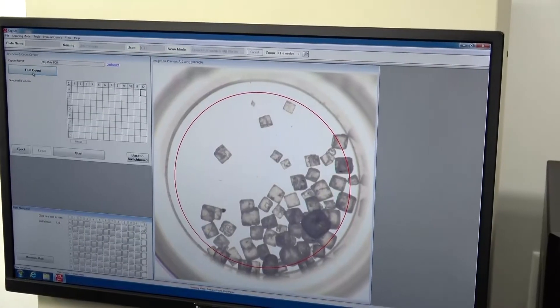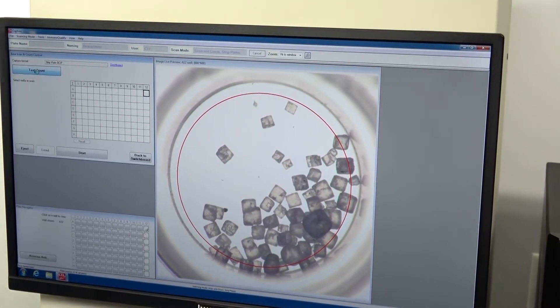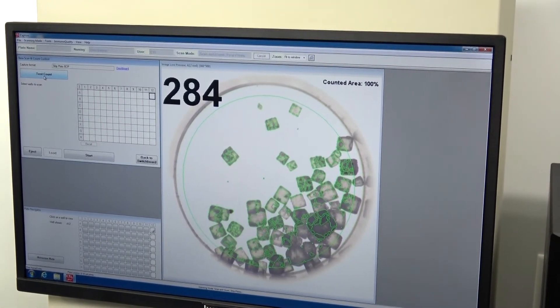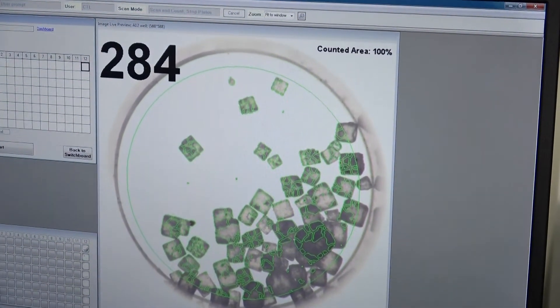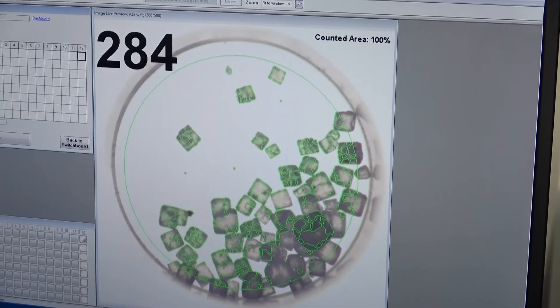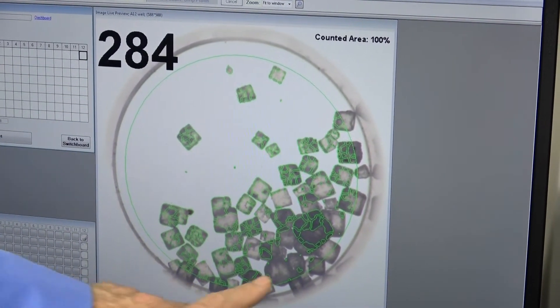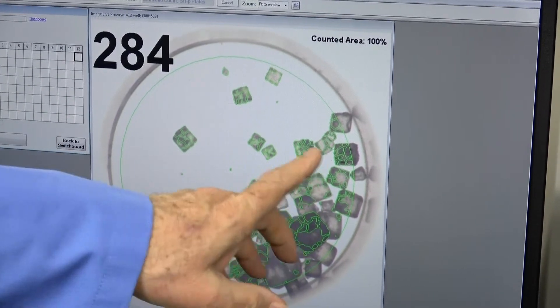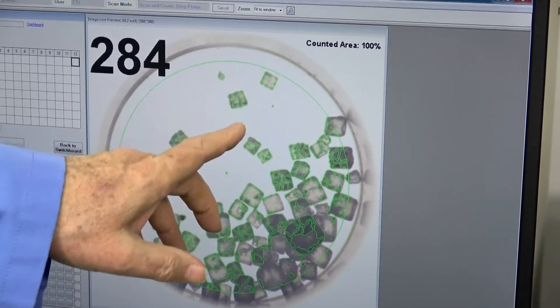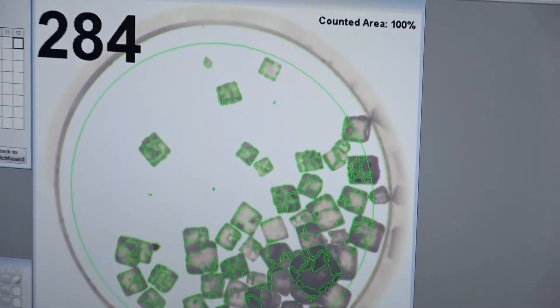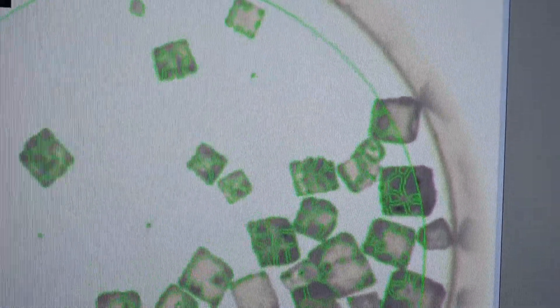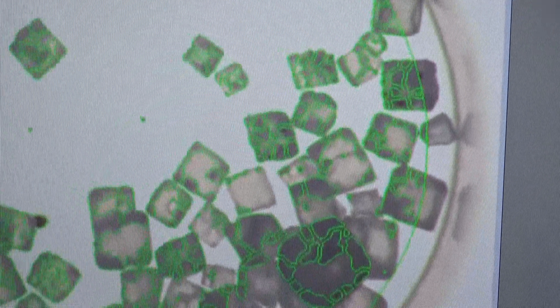I'll do a test count where it's going to look for things that it sees as a possible colony. As you can see, anytime there's a change between light and dark, it's seeing that as a colony. It says there's 284 in that well.